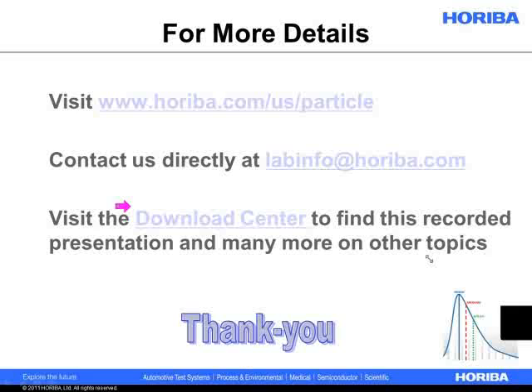Manish is asking, how do you control the transmittance? Well, you control the transmittance by adding different amounts of sample. A lot of times, one of the more common method development tweaks that we make for users is if they have a very highly concentrated starting material, or if it's a powder and they're predispersing it into something, we'll dilute it a little bit further down so that when you're adding material to the analyzer, one drop here or there isn't going to wildly swing the transmittance.